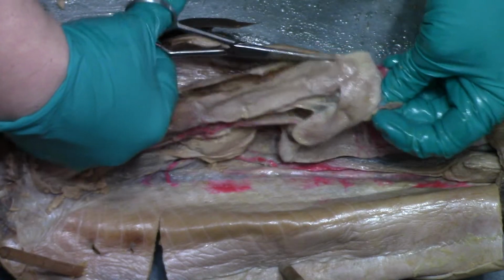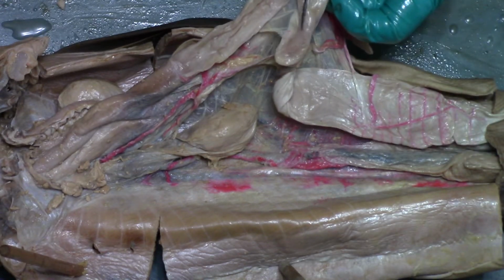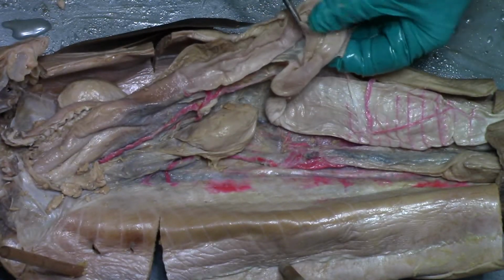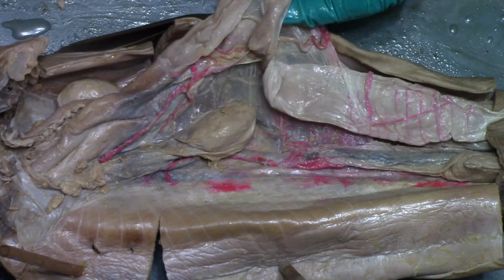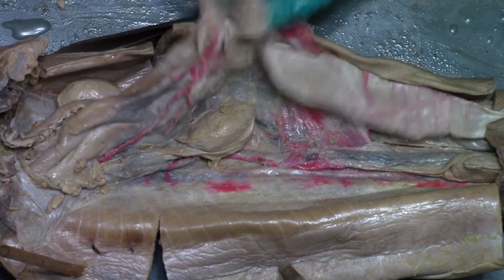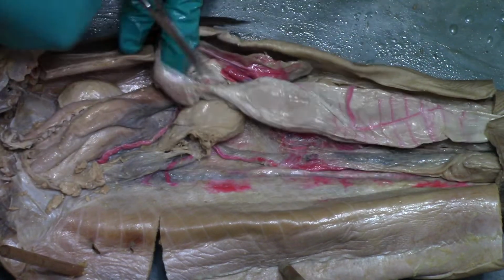Keep cutting down into that J part of the stomach, and then we're getting into the intestine, and you can see it still has that ribbing, and then it's a valve when we get down here. This is twisted, that's cool.